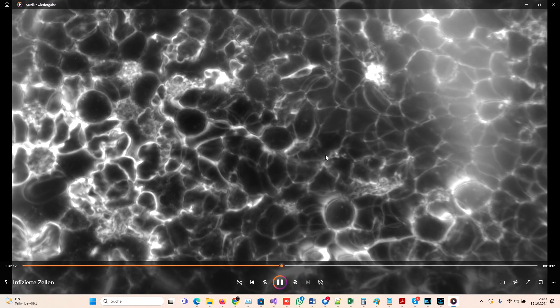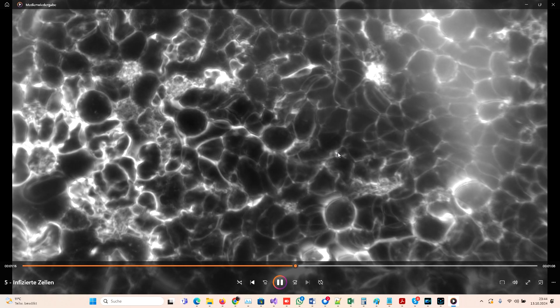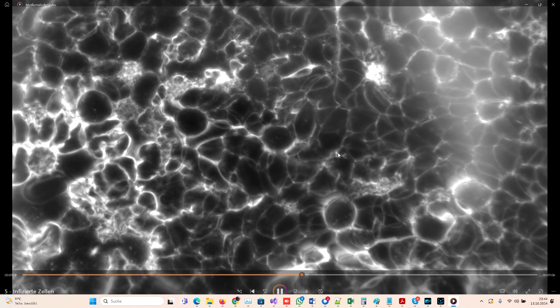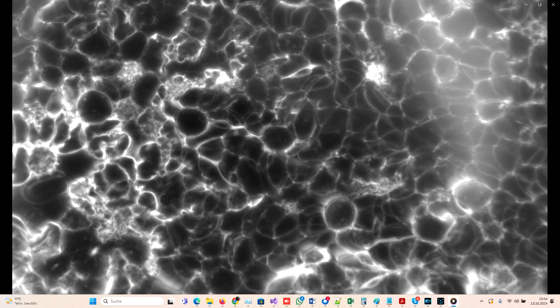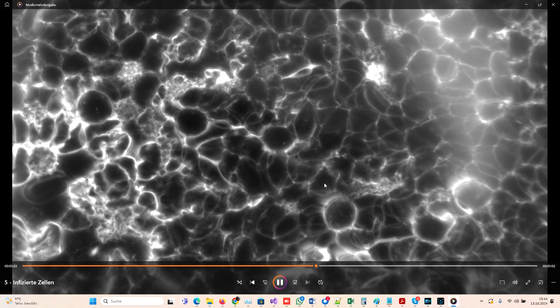The form of the blood cells should not look like that. It's just because they are agglomerated - there are too many blood cells in one spot, that's why it looks like that. Normally they should be more spread out.